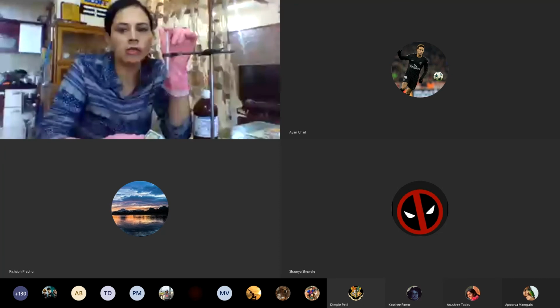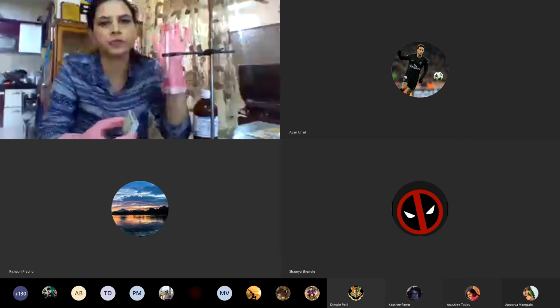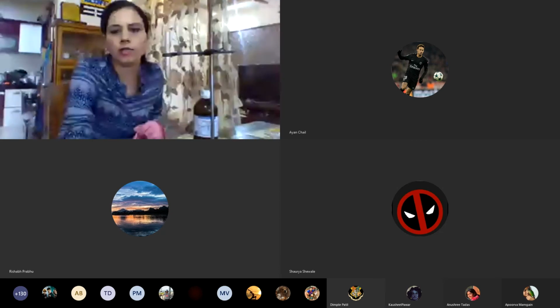So what will happen? There will be a pop sound. You have to listen very carefully. There will be a pop sound. Okay, so let's start.